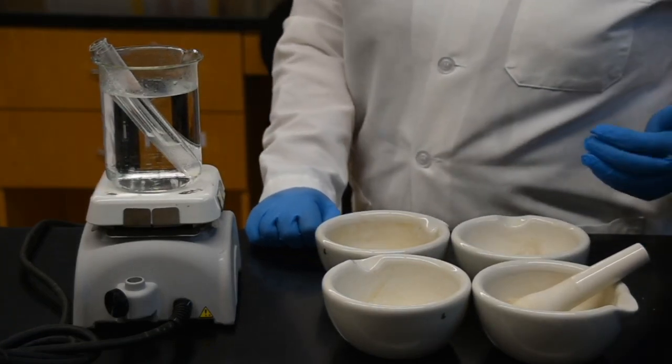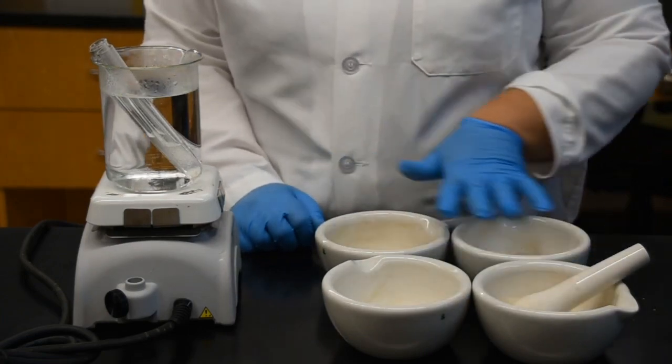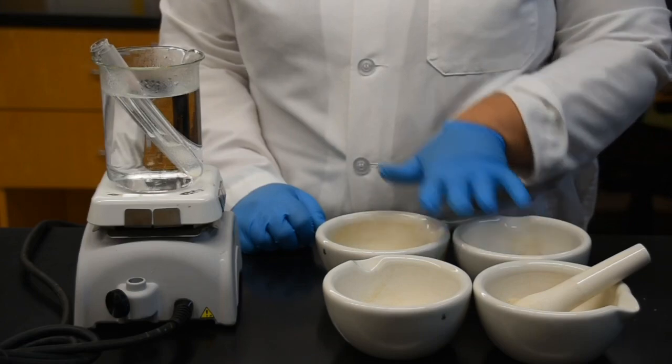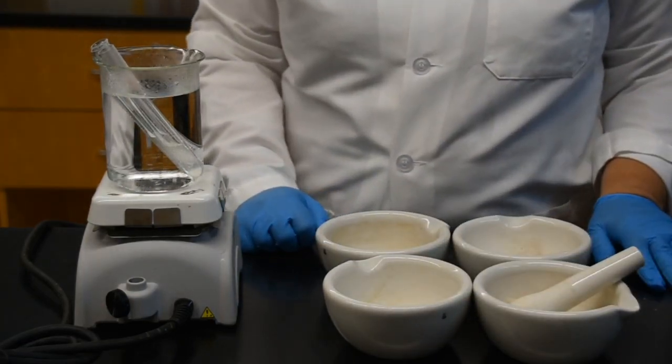So if you take a minute and I ask, okay, how many test tubes total do I need to run this experiment right here with these 4 samples, you will need a total of 12 test tubes, right? 3 for each sample to test each of the indicators.